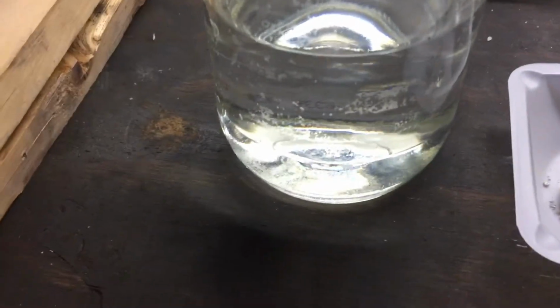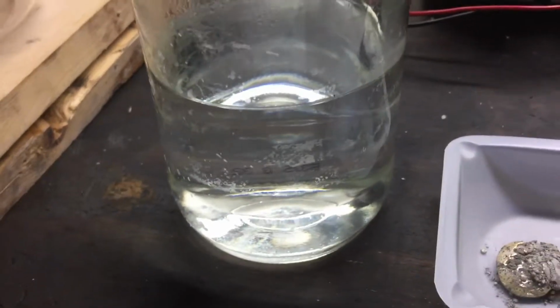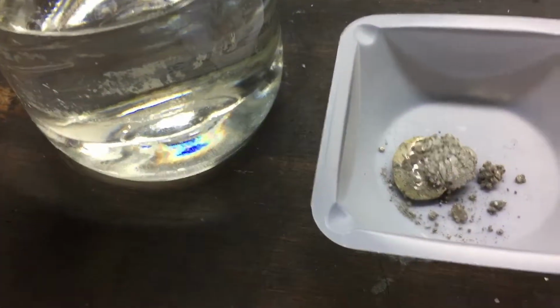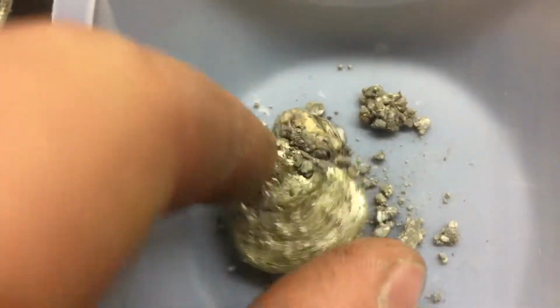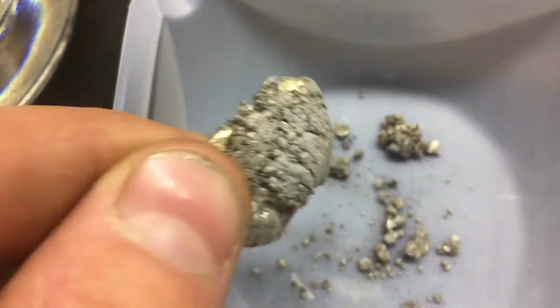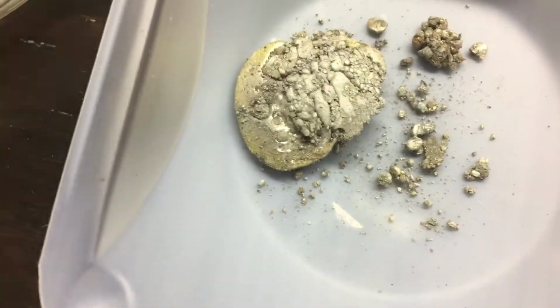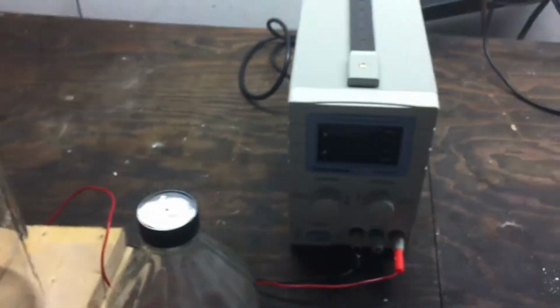Alright, so the tin chloride here has been effectively filtered off. I have approximately 330 milliliters of solution, and I collected the undissolved matter from solution, and I tried to incinerate it, or melt it I suppose, into a single ingot. And as you can see, there is a very large blob of tin surrounded by several other metallic components. They look to be oxidized, and I'm going to assume that those are the impurities, which I was trying to remove, obviously. And so now that I have my solution, I'm about ready for electrolysis, as you can see.